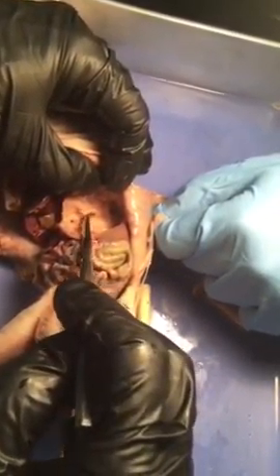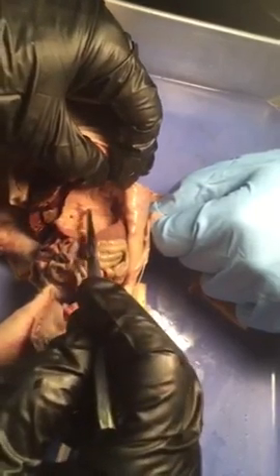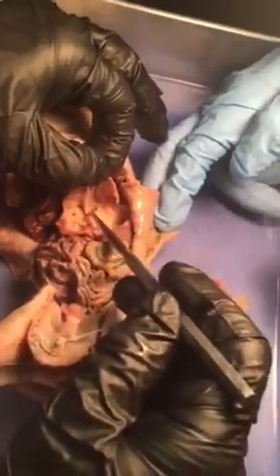But if I take my probe and I put it in here, it's going to go up into the esophagus. And I can get the esophagus, let's see, I'm sure this is it.